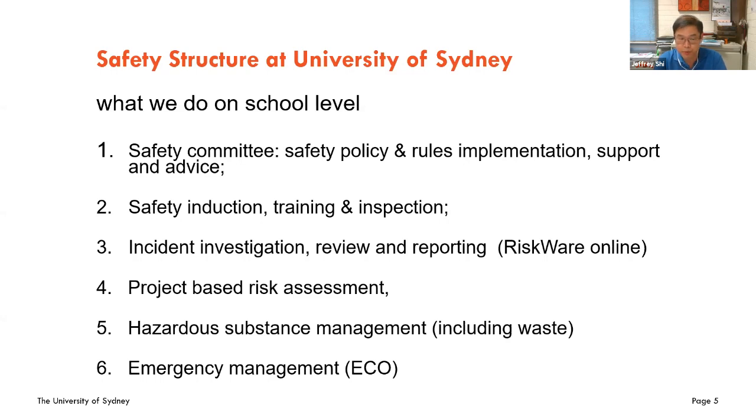We're also responsible for incident investigation, review, and reporting through our online Riskware platform. For any new research project, there is a project-based risk assessment requirement for any activity happening in the building. So we are using a so-called green permit system to safety check all activity happening in laboratories.